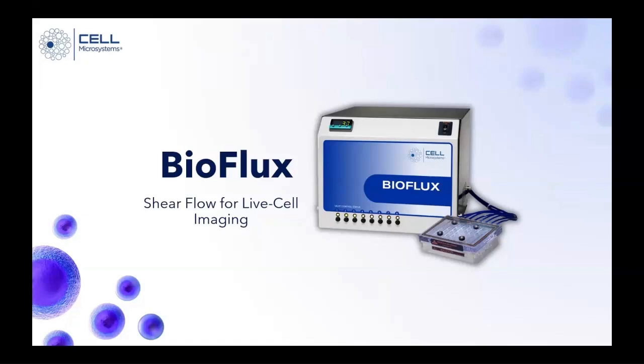Okay. And the next question is, how often do you need to clean or change the tubing of the BioFlux system? So the best thing about the BioFlux is that we do not need to change the tubing all that often or at all. All that we're moving from within the tubing is air. And it is this pressurized air that will then push whatever has been loaded into the plate through the microfluidic structures of the plate. So we're not pushing any media or any fluids through the tubing. It's all controlled pressurized air.